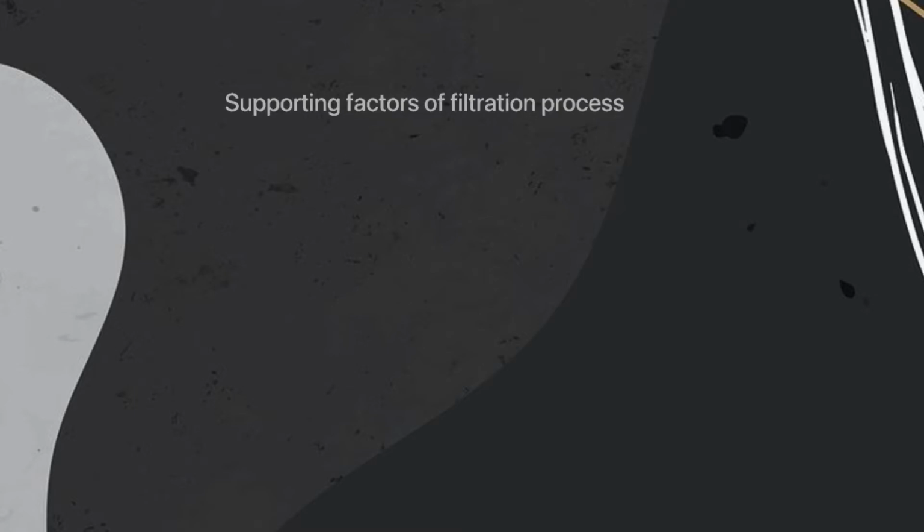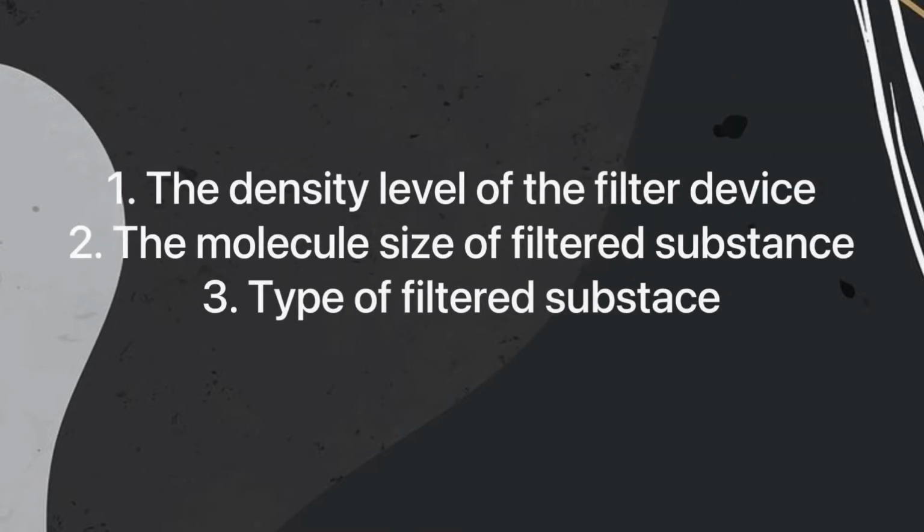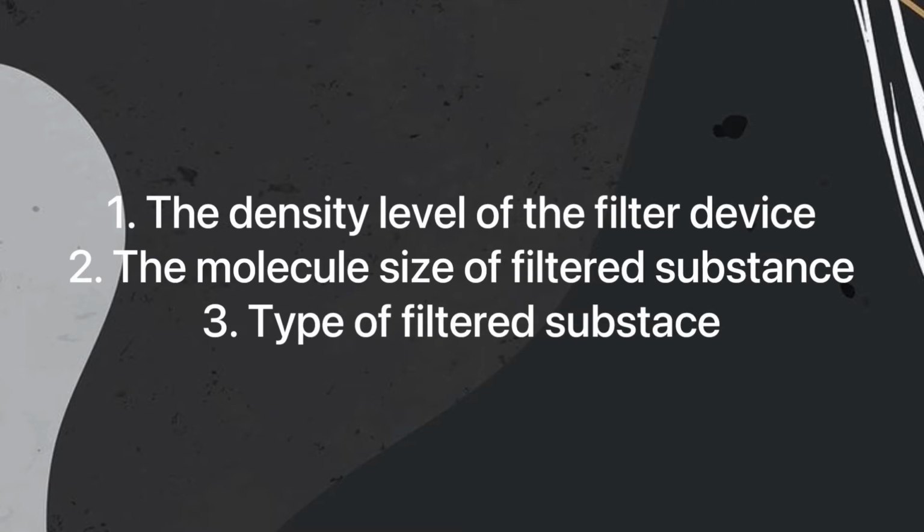There are three factors that will support the filtration process. The first one is the density level of the filter device. The second one is the molecule size of the filtered substance. And the last one is the type of filtered substance.